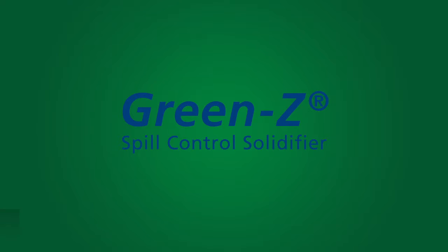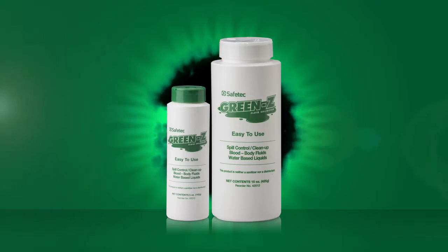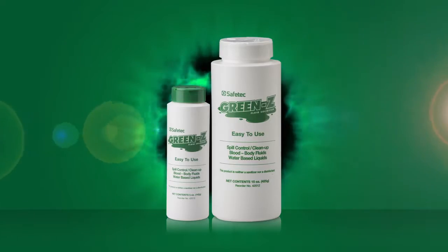To help reduce risks related to potentially infectious blood and hazardous chemical spills, rely on Green Z for improved safety in your spill cleanup process.